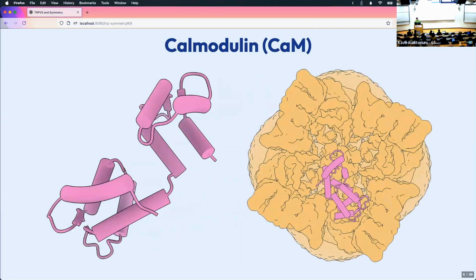Okay, so we're seeing something kind of weird here. We have four times too much calmodulin, right? Every ion channel should have one, but we're seeing density that's there for four. The other weird thing that we're seeing here is that the calmodulin is much, much weaker than the surrounding map, right? If you remember, when I looked at the map at that contour that looked really good, you could only see that one little blob in the middle. And then as I contoured way, way down and we were looking at the very, very weakest parts of the map, that is when this fourfold calmodulin appeared, right?